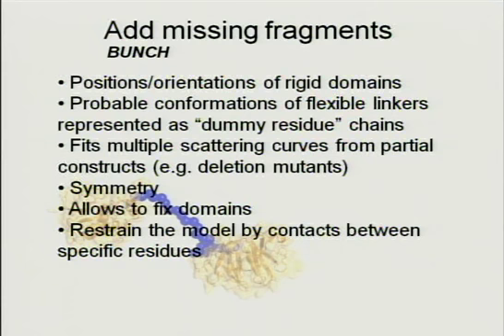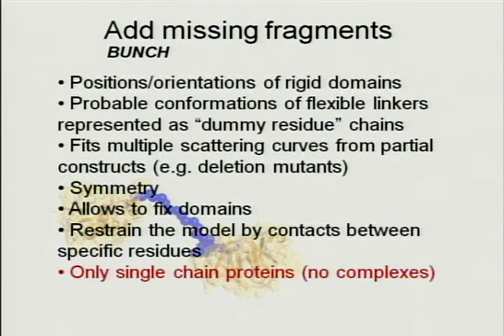So contacts are possible. The program will also check that there are no steric clashes. However, this approach is applicable only to single chain proteins. So you cannot do complexes with it.